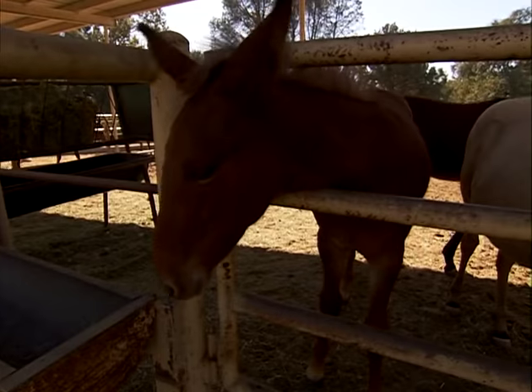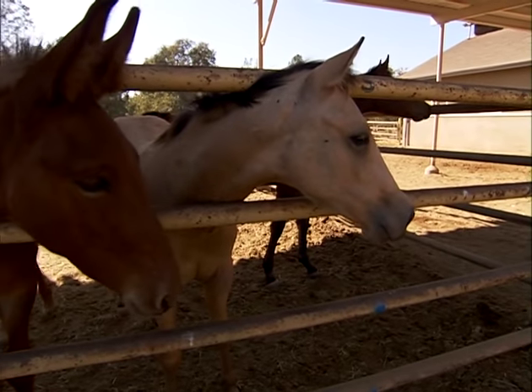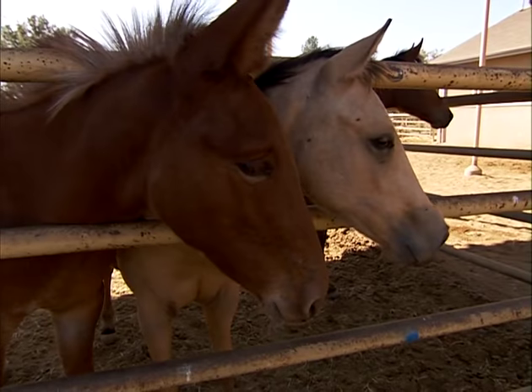In foals, this is the preferred method because the mane hair is usually too light and doesn't yield a very good root follicle. The root follicle is the most important part of the sample because that's where the DNA comes from.